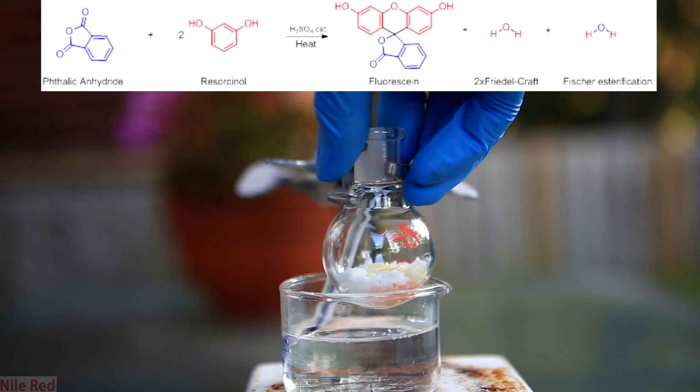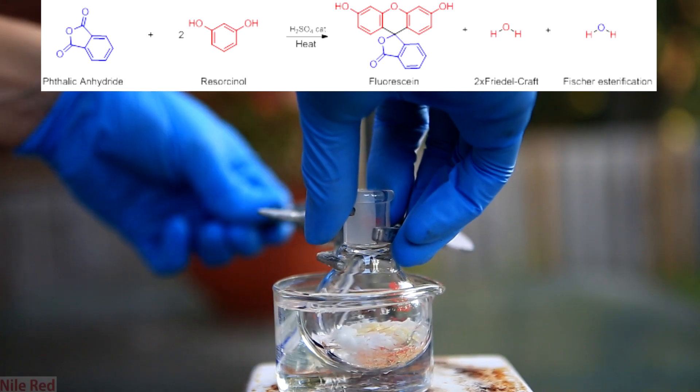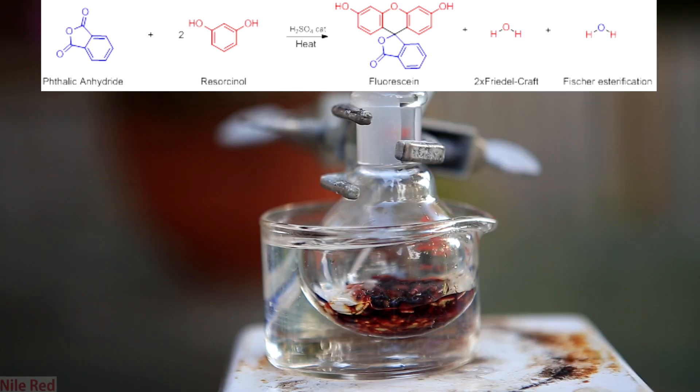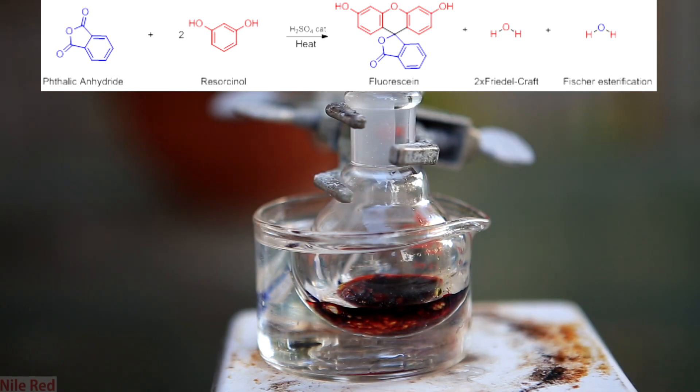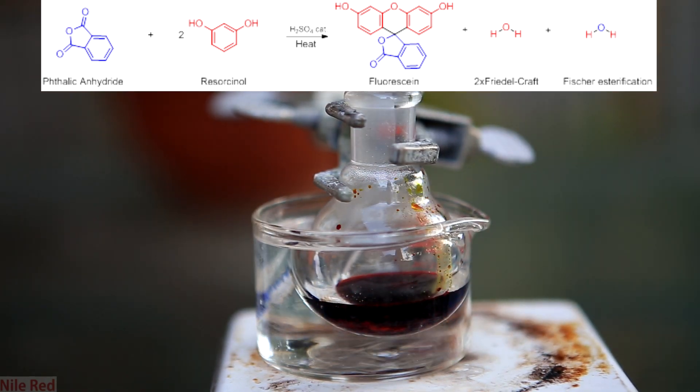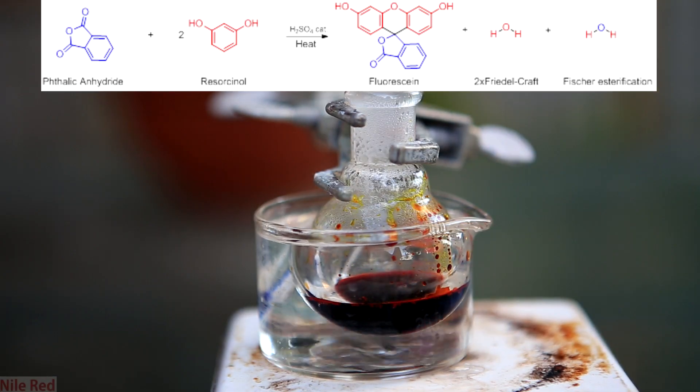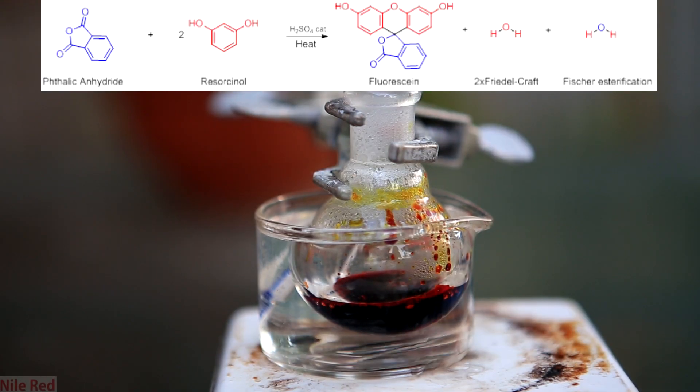It's then lowered into an oil bath and heated to 190 to 200 degrees Celsius. As the oil heats up and the chemicals start to react, you'll notice that a red color starts to form. This is actually the first bit of fluorescein being made. Slowly as the oil gets hotter and hotter, more and more will dissolve and the solution will get redder and redder until it eventually becomes nearly black. I had a stir bar at the bottom and eventually it became liquified enough that I was able to stir it. We want to heat it at this temperature of around 200 degrees Celsius for at least 30 minutes.